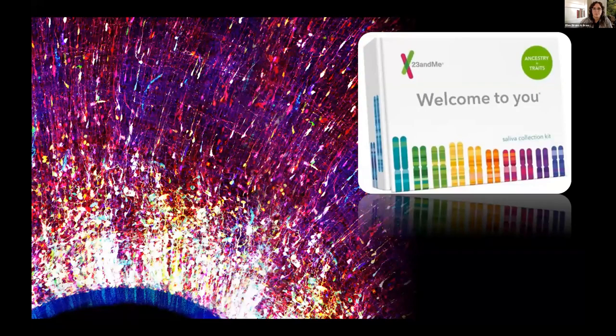So to start, I'm Ellen, and I'm a neuroscientist studying the networks in the brain as they develop. So you might be wondering then why I'm showing you these two images and what they have in common. On the left, we have a zoomed in view of the image that's currently on display in the Koch Institute galleries. And this shows a cross section of a brain that was in the process of growing new neurons during normal brain development.